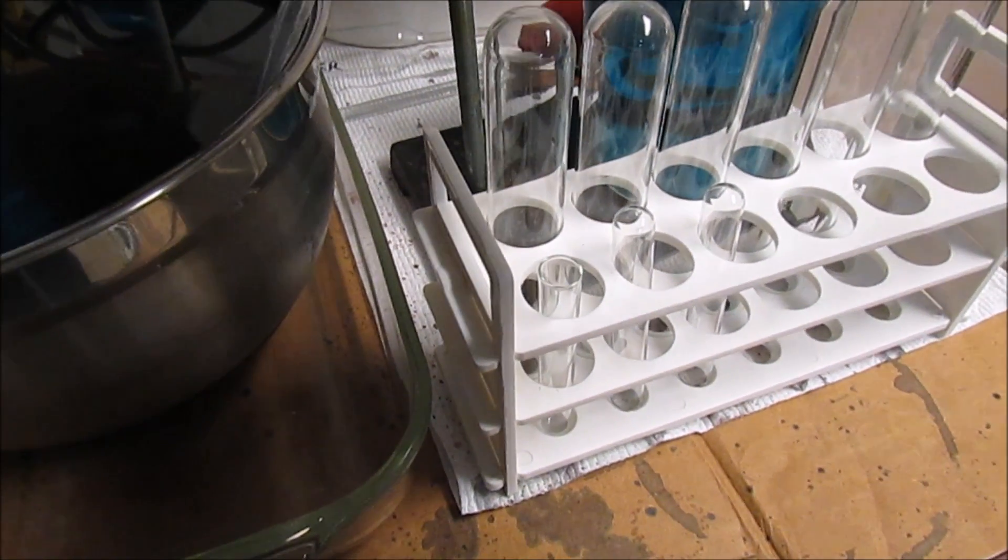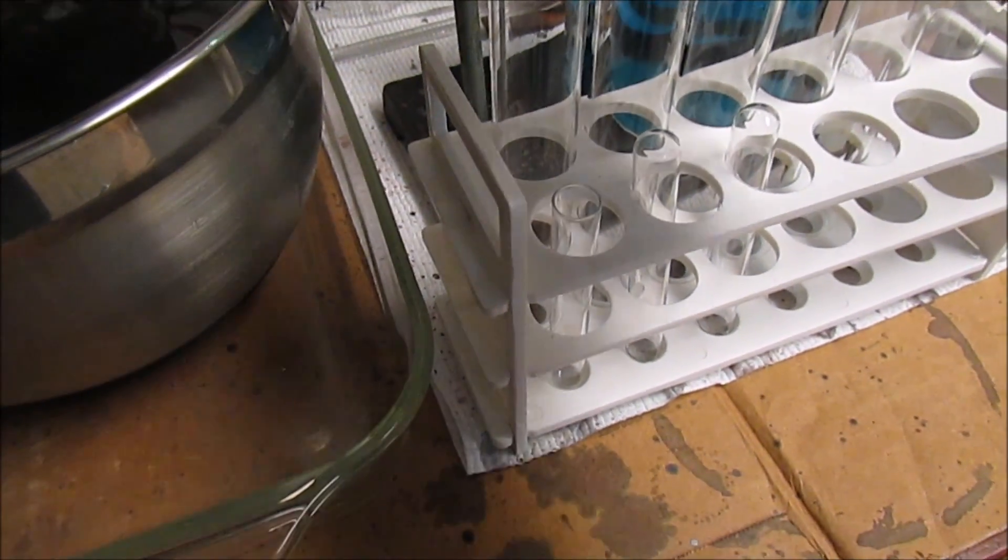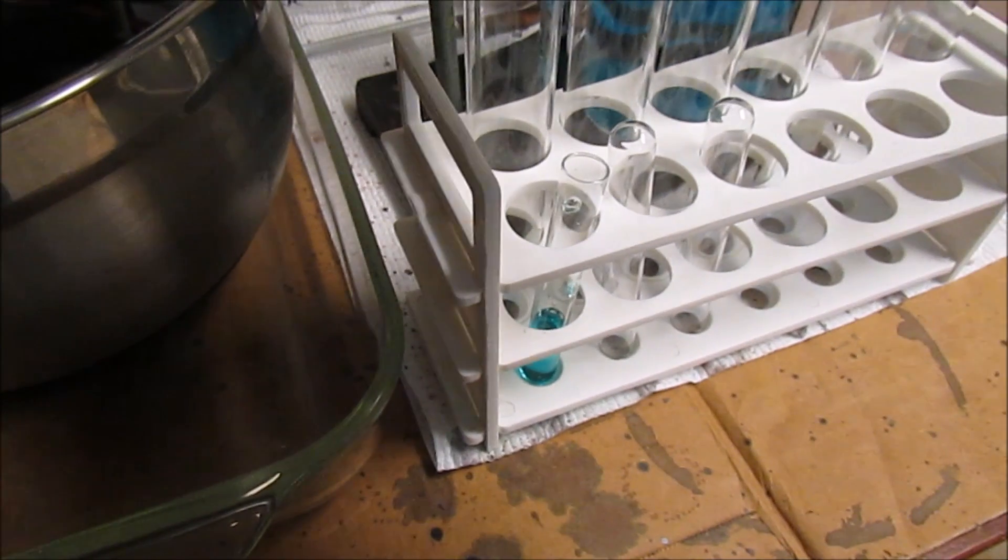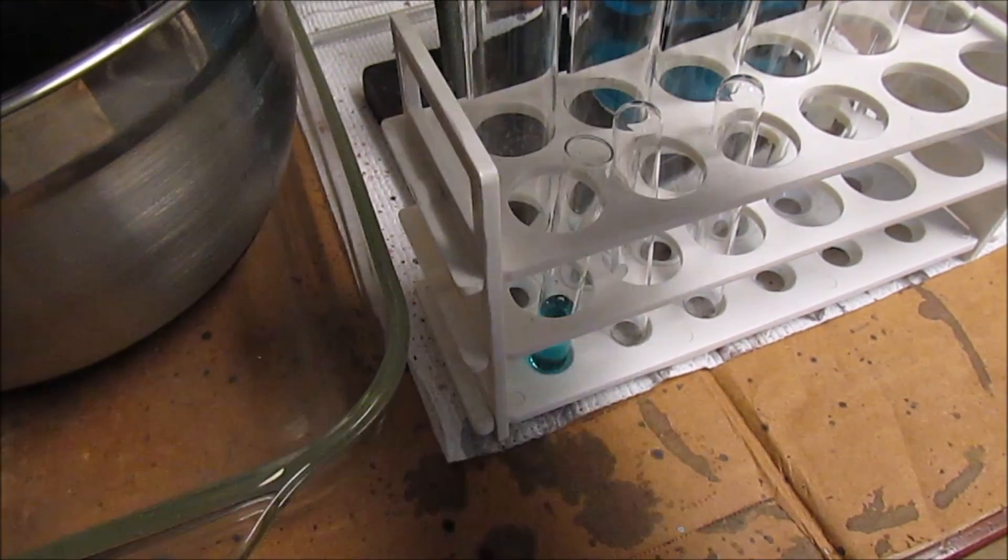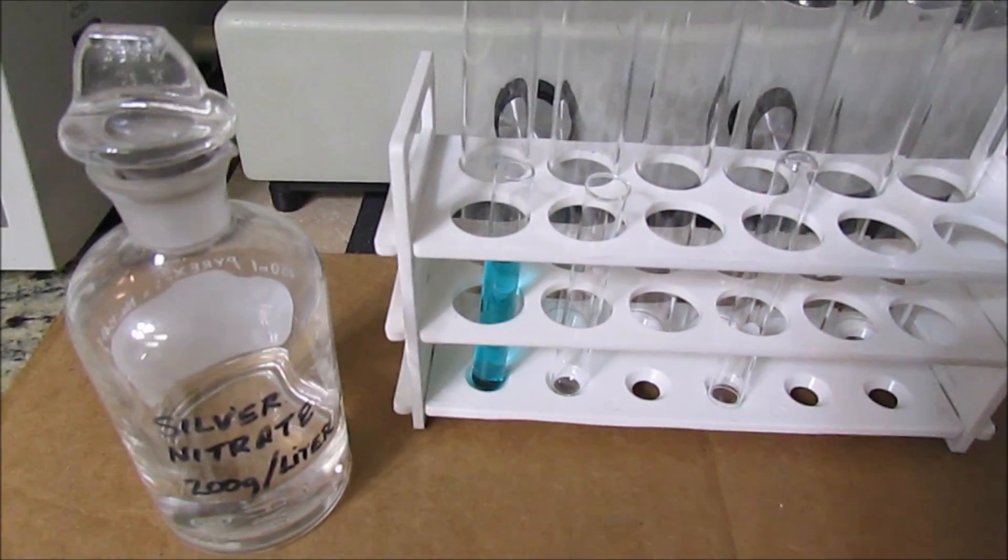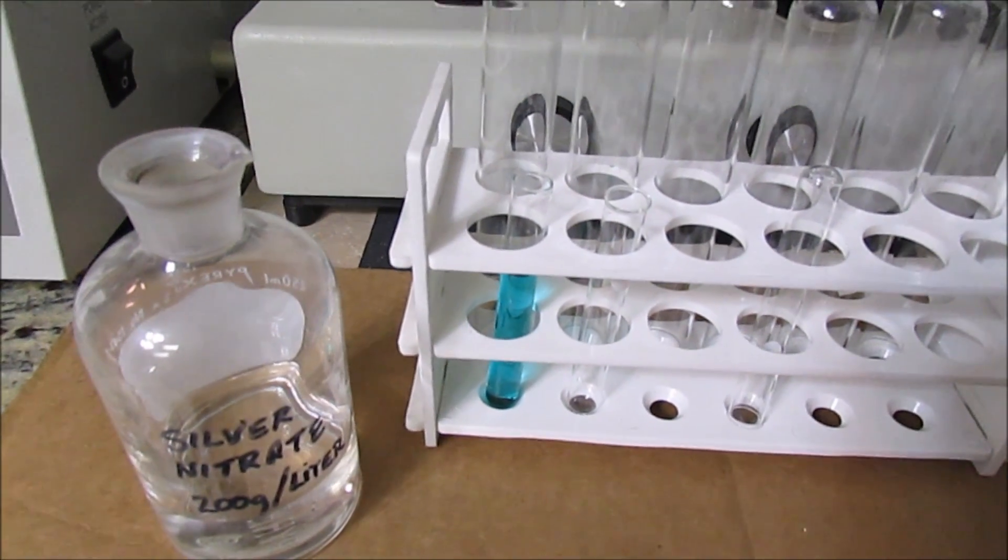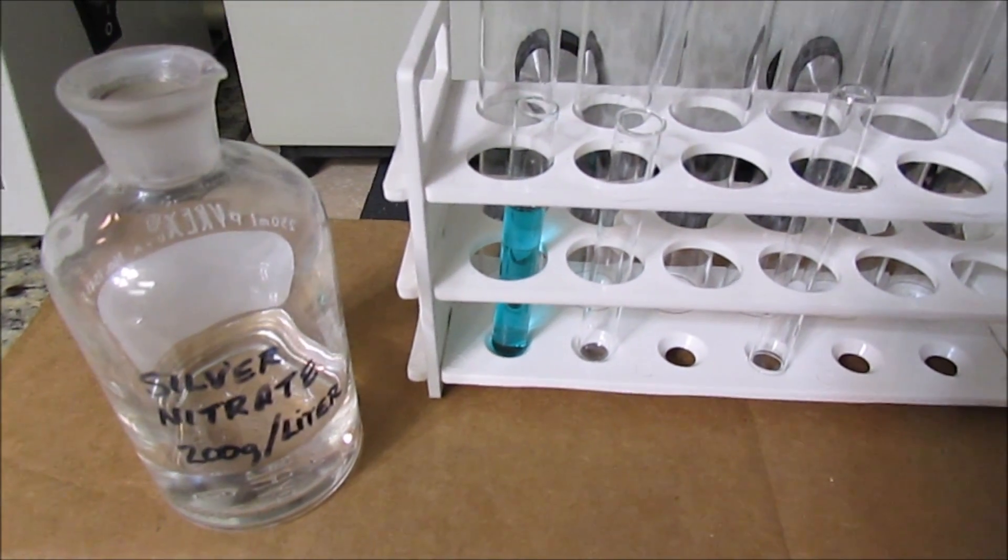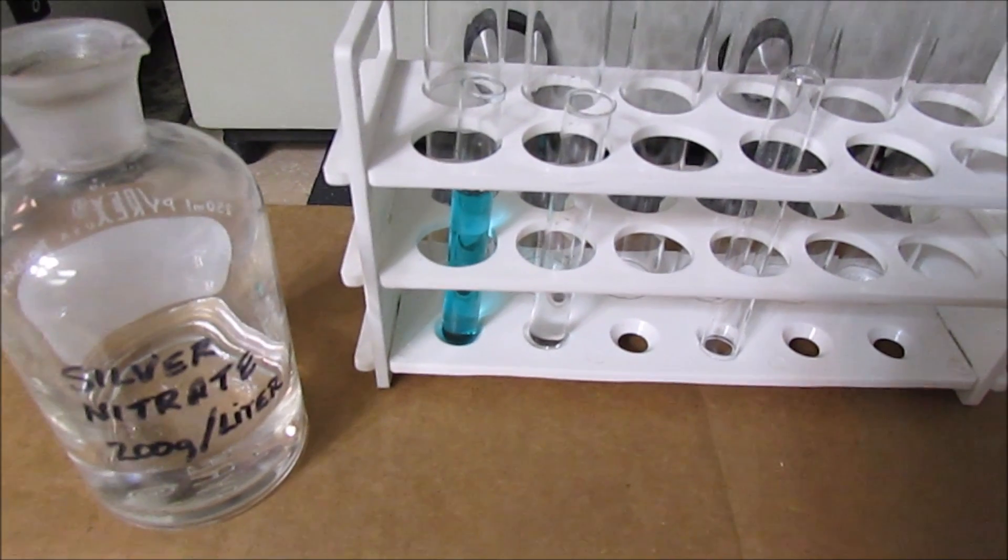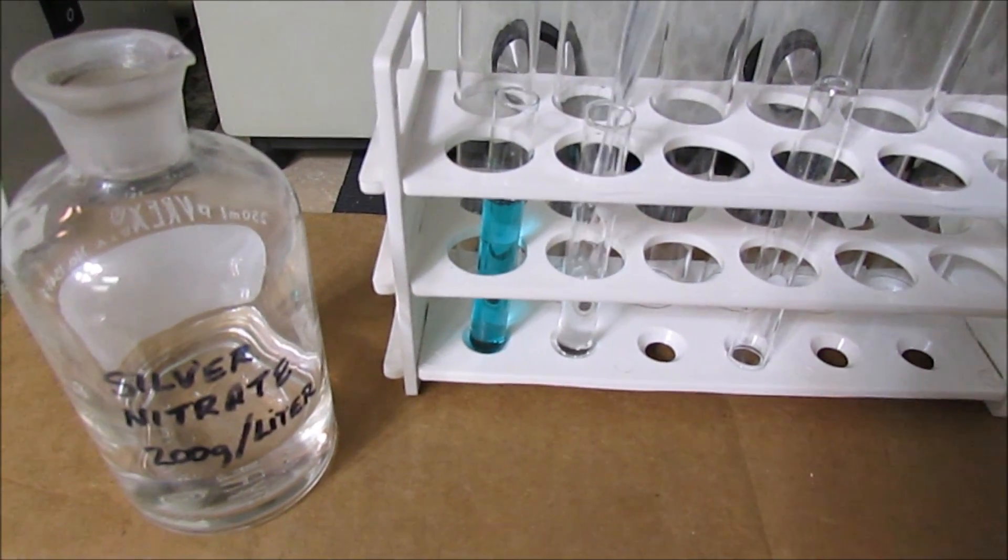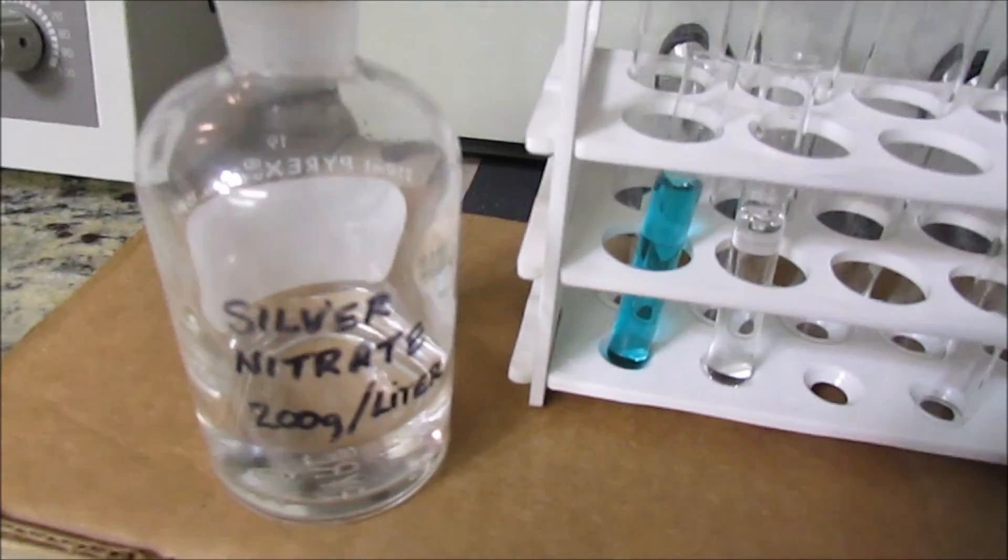I'll draw a sample up out of my electrolyte that I want to test and fill one of my little tubes here. Now I'll draw a sample of silver nitrate solution to use for the blank. This is 200 grams per liter.